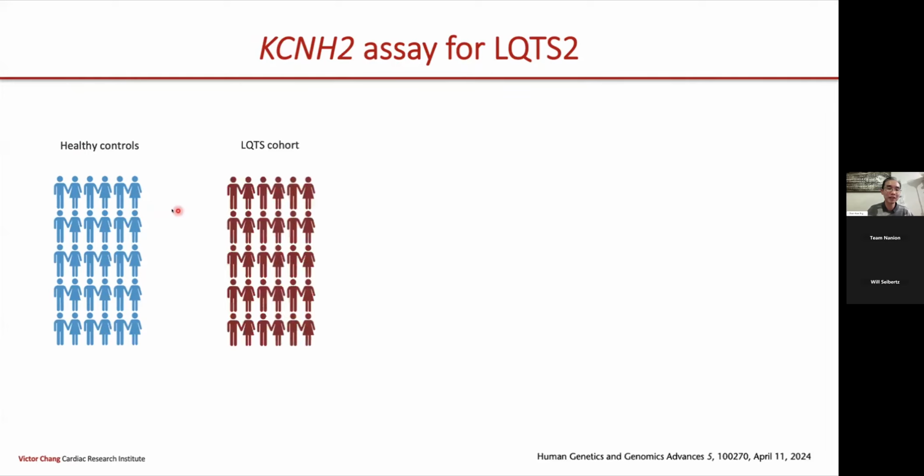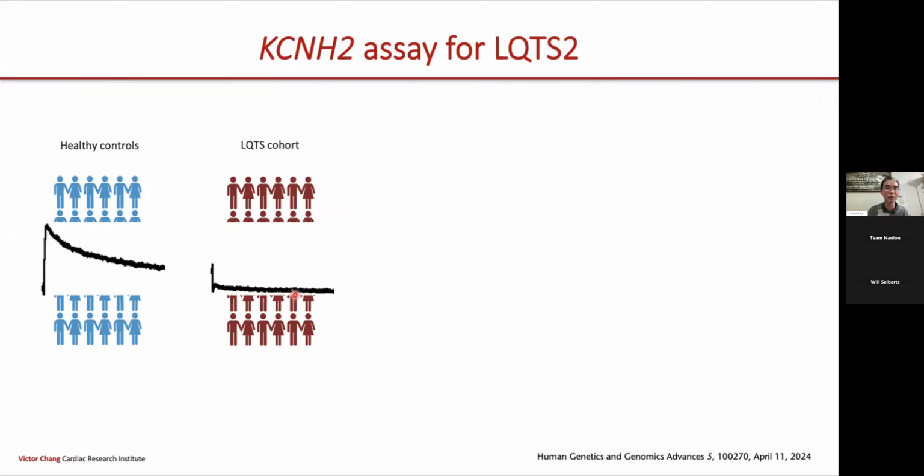Simultaneously, we curated 30 non-pathogenic variants, but we don't simply go with ClinVar and take those. We actually use internal databases from those testing laboratories, curate a large number of probands, and then ask clinical geneticists to independently assess them again in the study. So we make sure everything is done correctly. After all these are curated, I generated them into stable cell lines and measured the current. This I have described before.